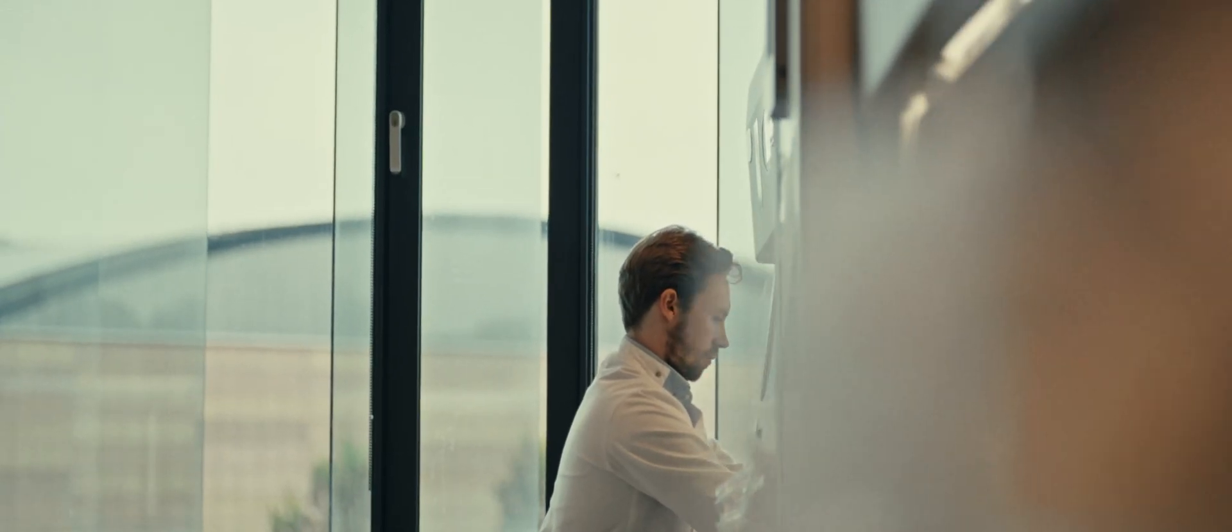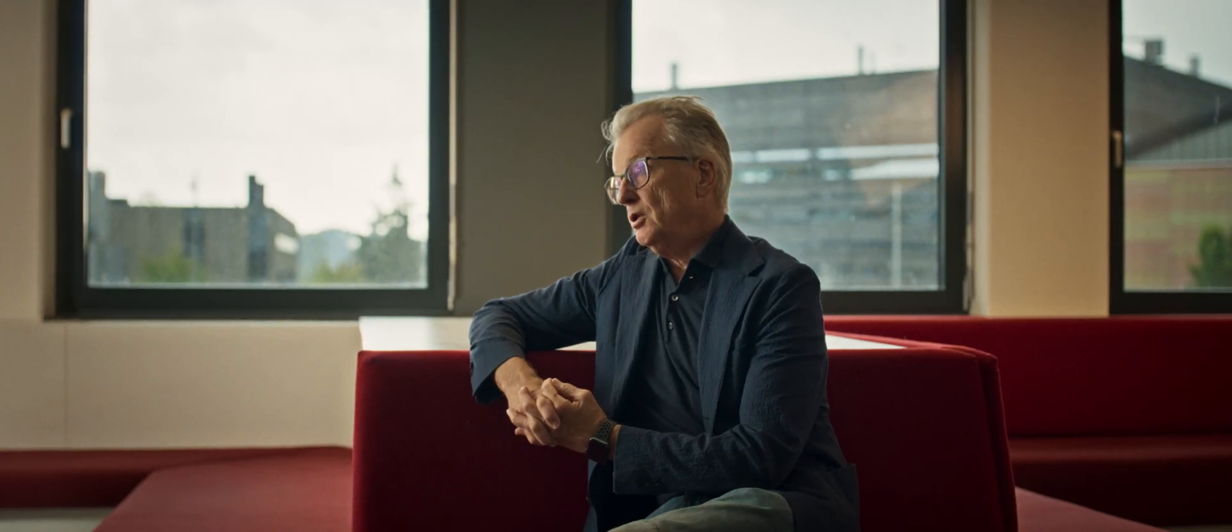The reason we like to work with Single Cell Discoveries is that their technology allows us to get a really detailed insight into the therapeutic effects of our therapeutics in neurons.